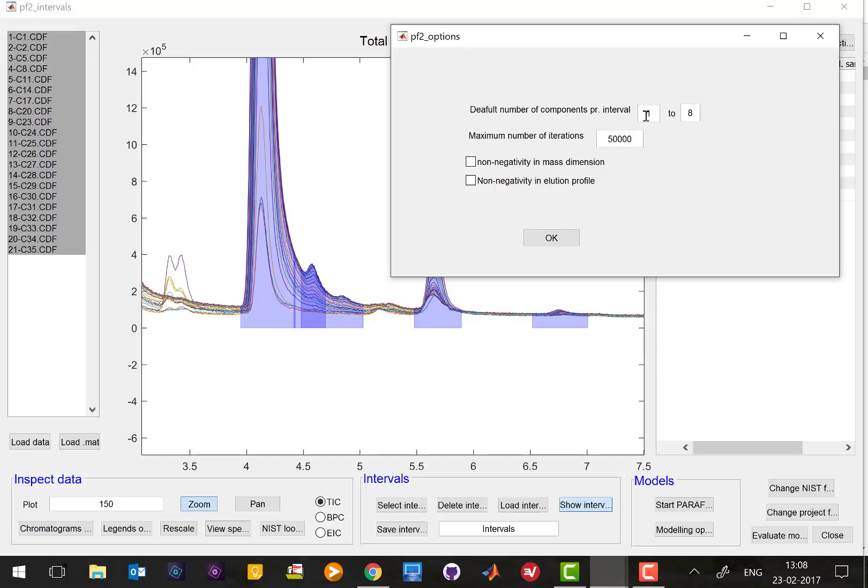You have to press the modeling options and then you have to choose how many components you think there could be. So the settings here says I'm going to investigate in every interval from one to eight components and as a basic setting that's fine. If there are more than eight in some intervals you will see that later on and we will explain how you can fix that.